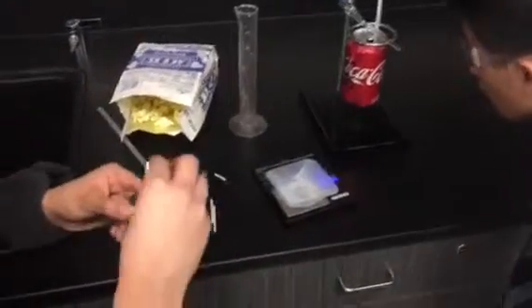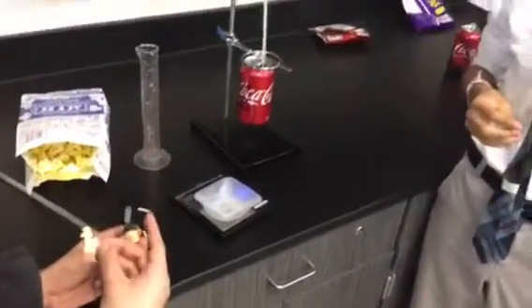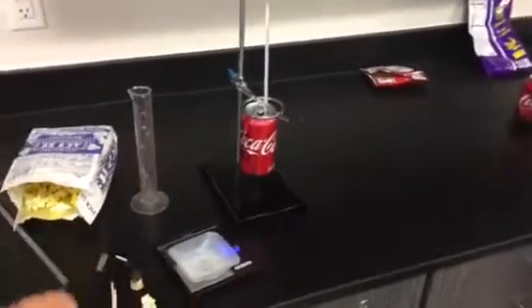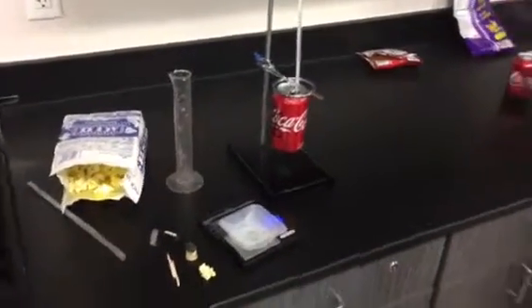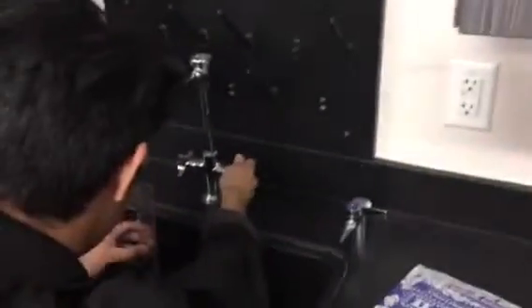Okay. Water initial is 33. Do we need to put new water in? Yeah, you need to put new water. When you heat things up, do things evaporate? Yeah. So do you think there's exactly 50 in there? No. So you have to fill her up.